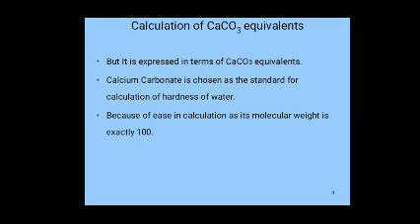It is also easy for calculation as its molecular weight is exactly 100.